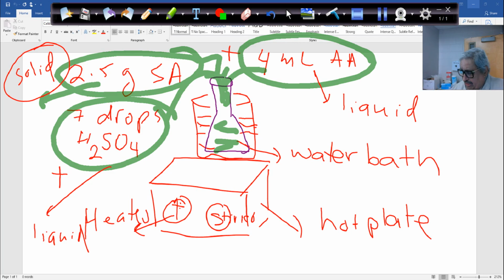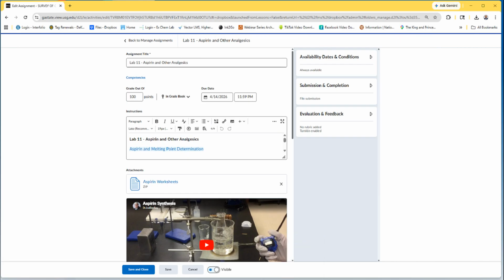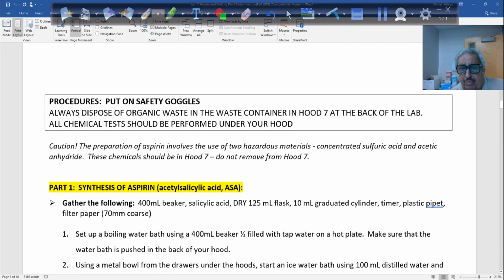Then you put the filter paper inside the Buchner funnel. The Buchner funnel is a funnel made of ceramic porcelain with holes inside, so it can hold the pressure of the vacuum. You cannot do it with a small tiny funnel. It will collapse. This is very heavy. Can I take this one out? I want to show you how this funnel looks. Okay, let's take this one out. Here it is. This is the Buchner funnel.